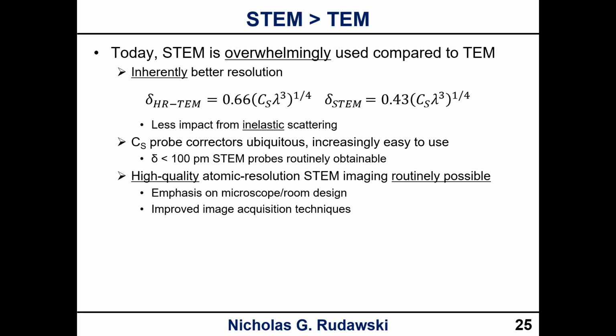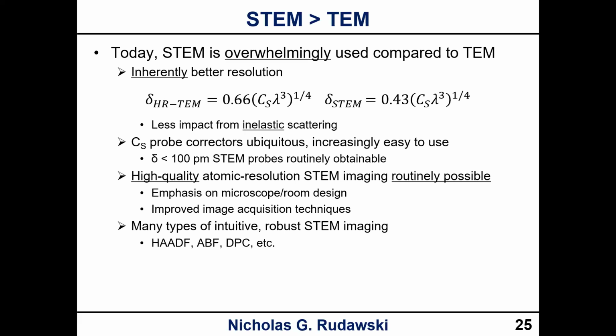And it's routine now to do high quality atomic resolution STEM, okay? Because we have renewed emphasis on microscope and room design, and we now have improved image acquisition techniques. And we now have a slew of different STEM imaging modes available.